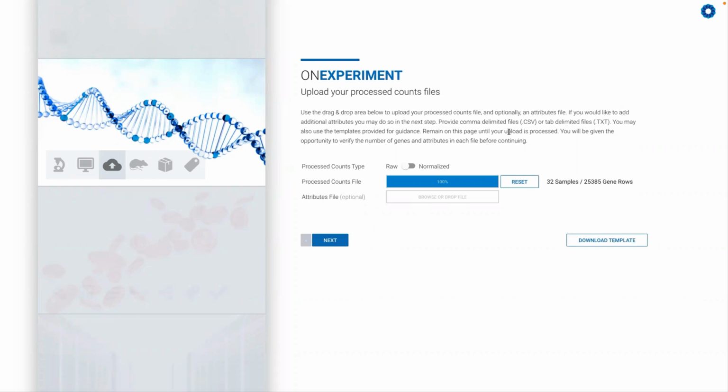Now, this follows the NCBI biosample bioproject data model, which is great to have a consistent ontology, and it's great to even simplify data submission when it comes time, should I choose to do that. So I'm going to grab my attribute file, which I have over here. This is a very simple file, and I'll also guide you through some of that step here in a moment. Rosalind immediately found three attributes that nicely matched everything that were here. If I had something off, so for example, I was missing a sample or the data didn't connect, I'd get a few error messages. Rosalind would tell me, hey, you're missing a sample, or this data doesn't look right. So I received very quick validation.